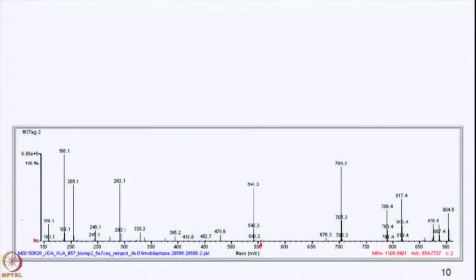All right, let's take a look at the next one that we have here. I'll give you some advance warning that this is not a tryptic peptide. This comes from an experiment where we're doing immunopeptidomics. So MHC, or what we call HLA peptides, human leukocyte antigen peptides, have been isolated, and this comes from the allele B57. This particular allele has a motif where the C terminus is usually tryptophan or phenylalanine.